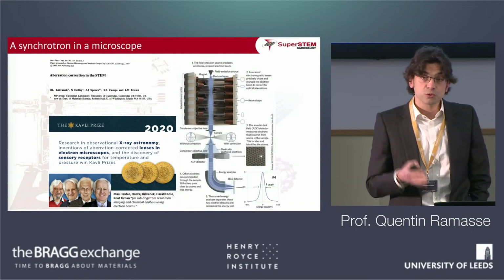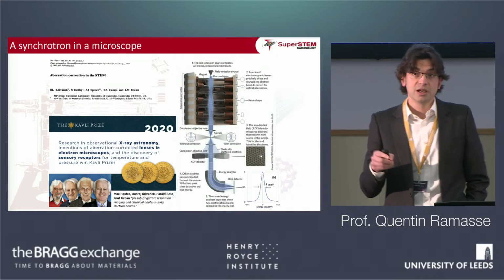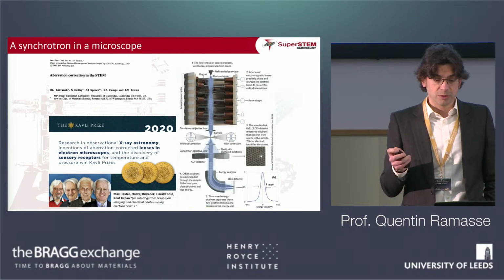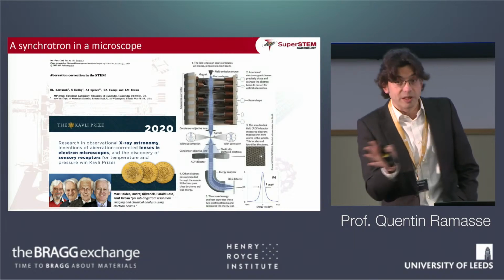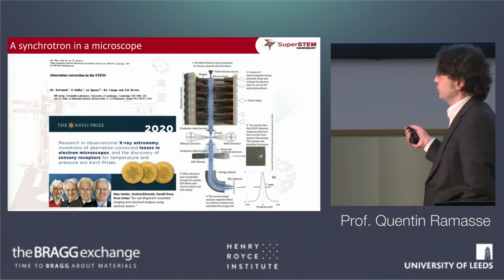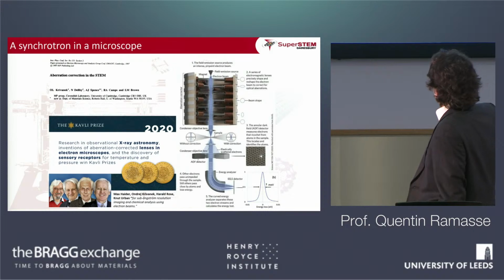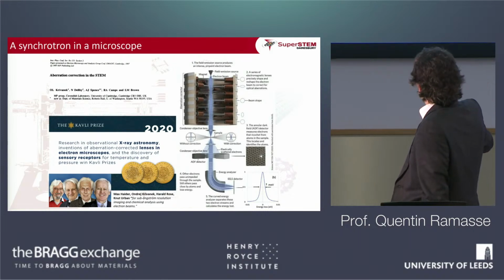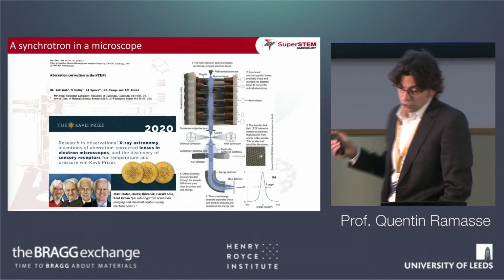And that leaves us with instruments that are really able to go and poke single atoms and look at all those material science problems at the single atom level. So on a very simple basis, a STEM, or scanning transmission electron microscope, is nothing but a very simple instrument. It has a source of electrons that you send through an electron column and focus onto your sample.